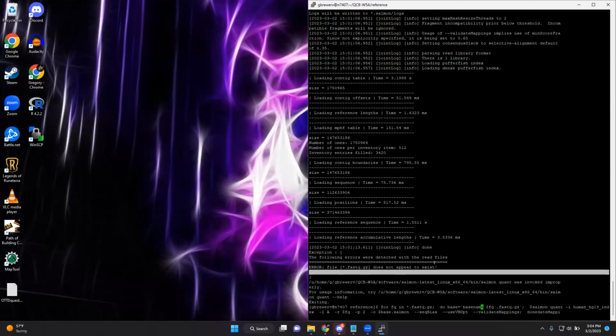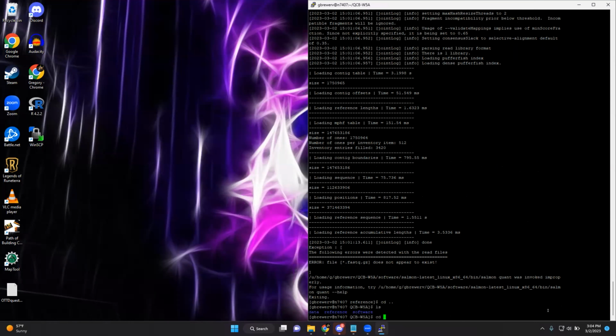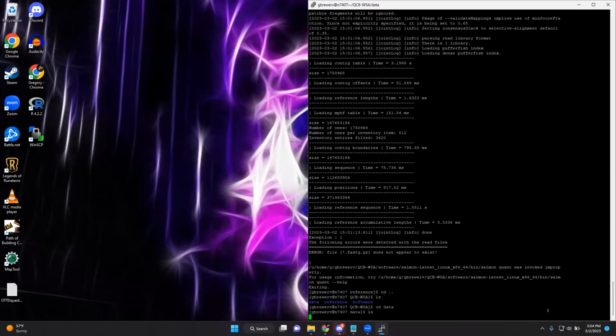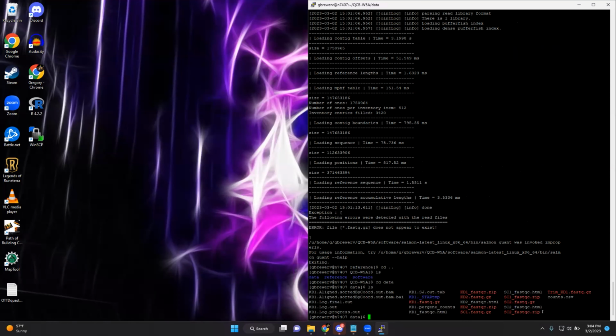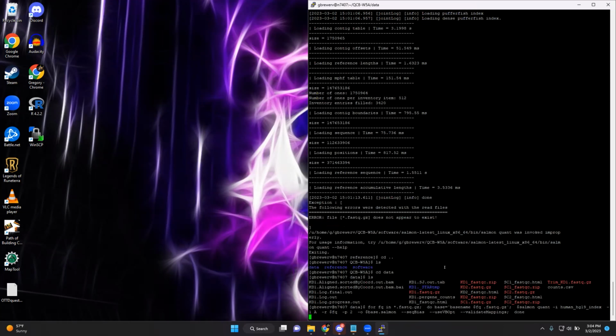You're in the reference directory. Oh, that's definitely it. cd data, was data where it was, right? Yeah. Given that you linked to the index that's in your reference subdirectory, it should run. Which you haven't, so be careful. Oh, whoopsies.